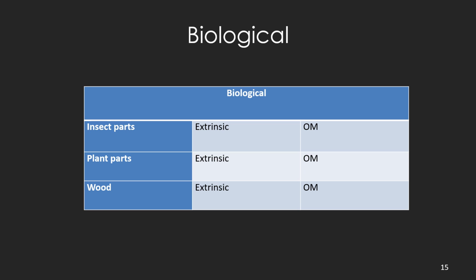And then there's biological. And with the biological, this can be extremely difficult because it requires that we be an anatomist almost in order to understand and recognize all of these things. But you can recognize reasonably well that this is a biological material as opposed to being a plastic material or a metal material.